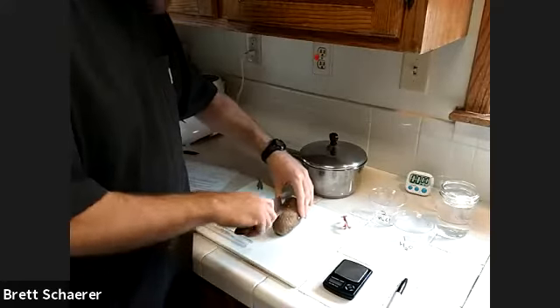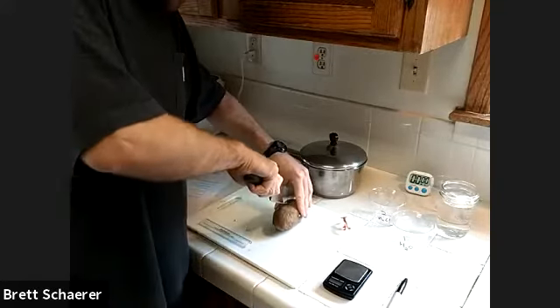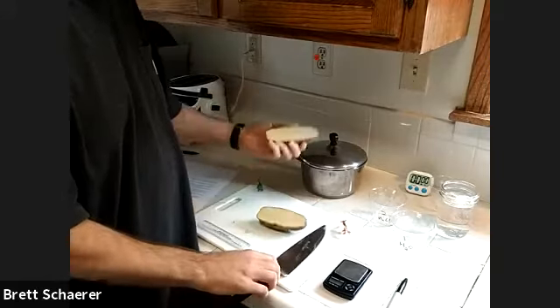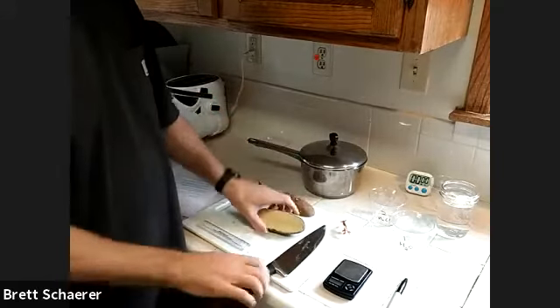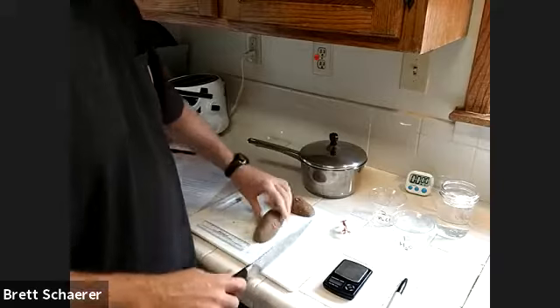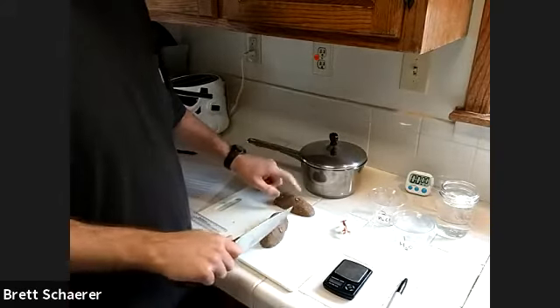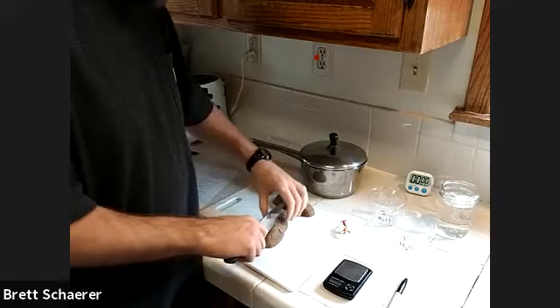So actually I'm gonna set some of this potato aside as a control. But I'm not gonna cut the control piece yet, just in case it loses some fluid sitting out on the cutting board.